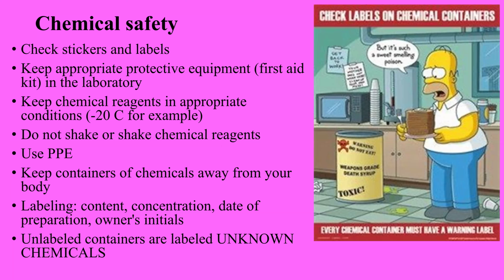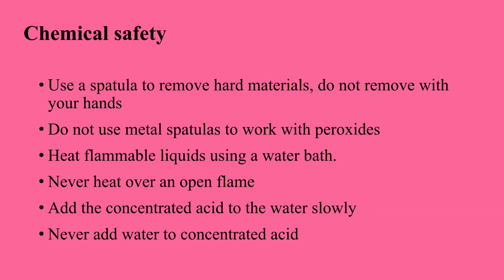It helps to orient in these chemical labs and find a responsible person if some experiment fails and you investigate what went wrong. Even primitive lab activities like solution preparation also need some training and awareness.